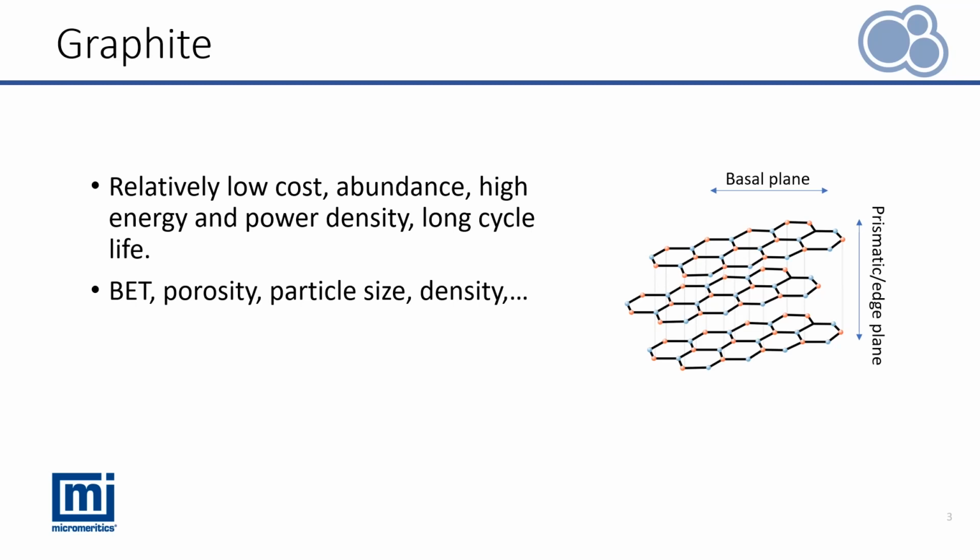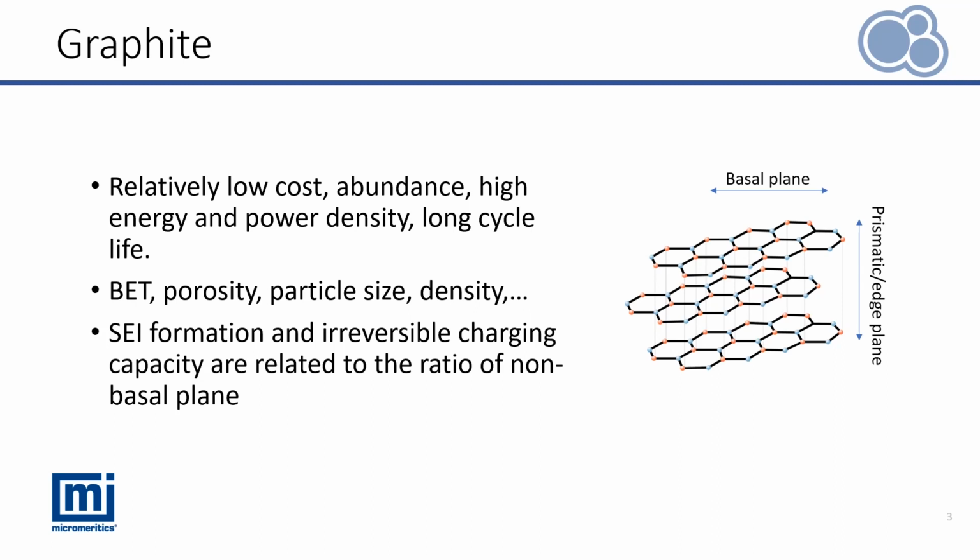The ratio of these planes are important to be characterized in the context of battery performance. For example, the formation of solid electrolyte interface, also known as the SEI layer, and irreversible charging capacity of lithium-ion batteries are related to the ratio of non-basal plane.